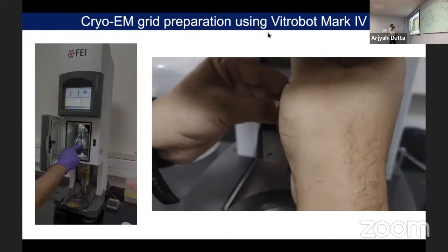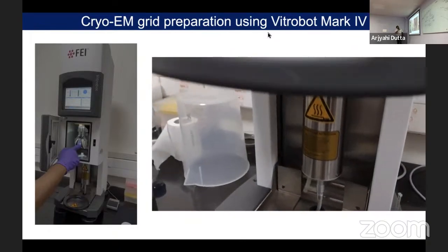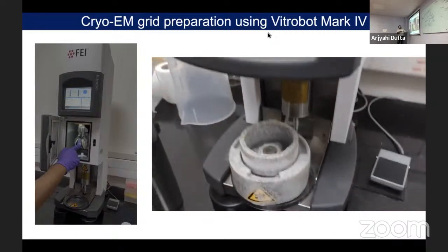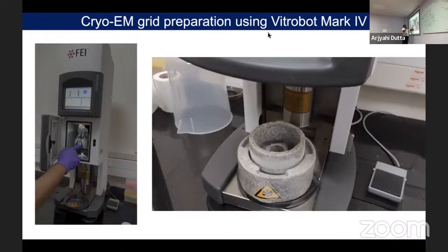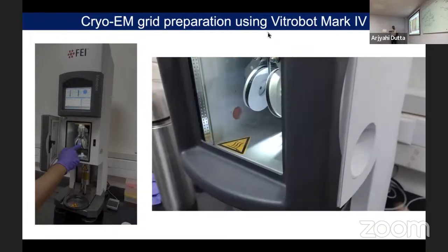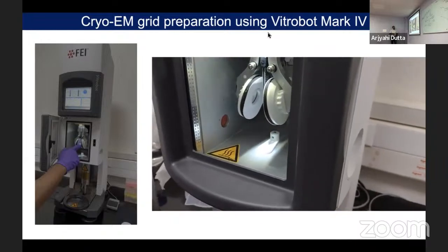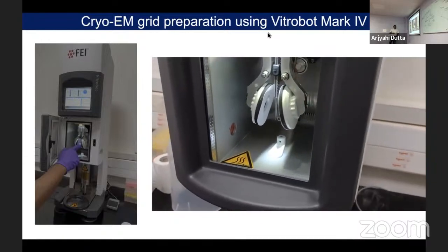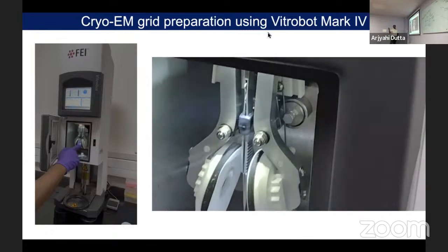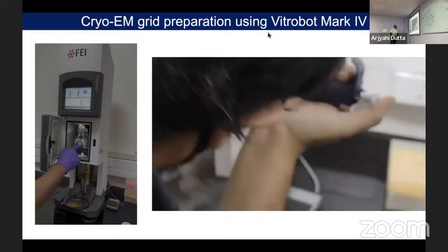Here I'm just quickly showing the sample preparation part, how we do this. We have a grid here, as I told you, a copper grid we are using. This is the area where we have the liquid ethane, and liquid nitrogen is in the surrounding area. Then we add a very small amount of biological sample and quickly plunge it into liquid ethane. So here we have the grid and then we add our sample here, and generally we use a very small amount of sample. This is the place where we are going to add the sample.